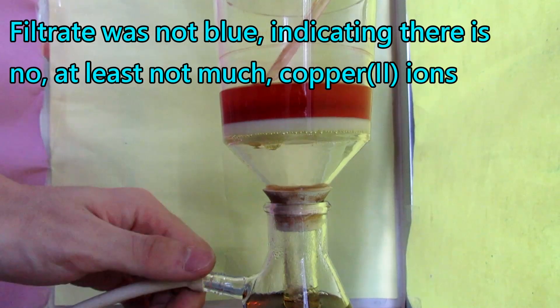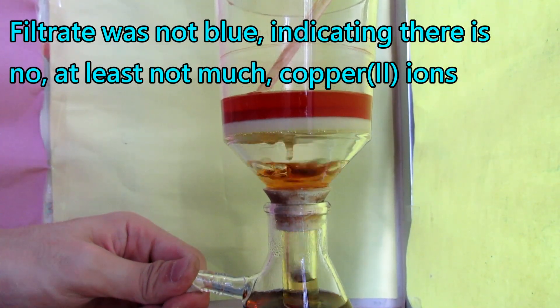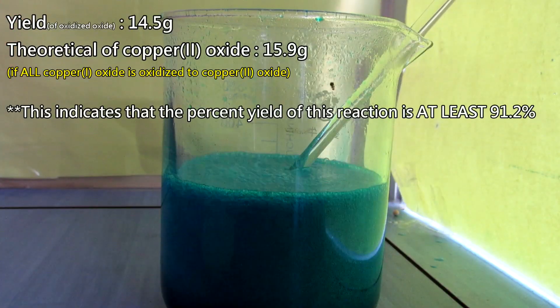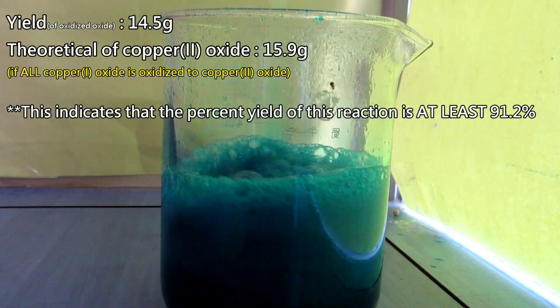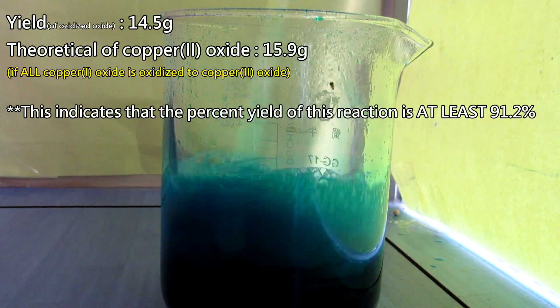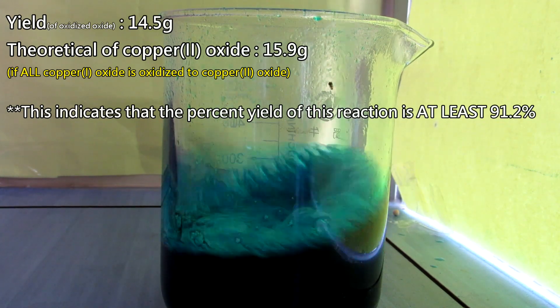However, judging by the color of the filtrate, I believe that all of the copper ions had been reduced. Also, even if all copper-1 oxide has oxidized to copper-2 oxide, the theoretical yield is 15.9 grams. So the yield is at least 90%.